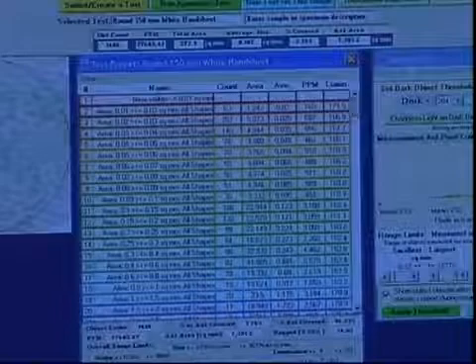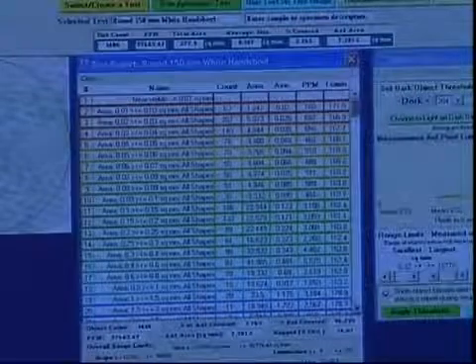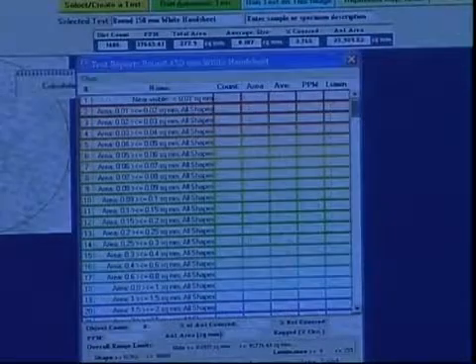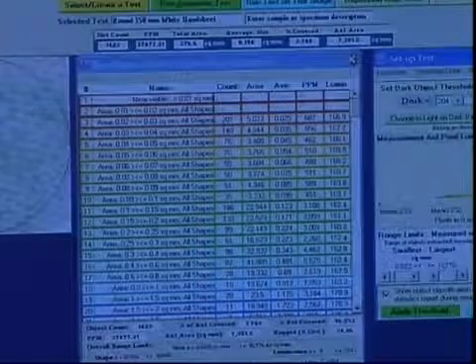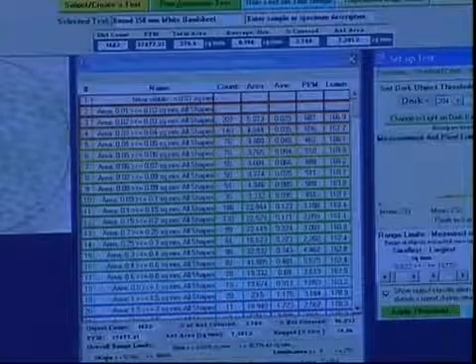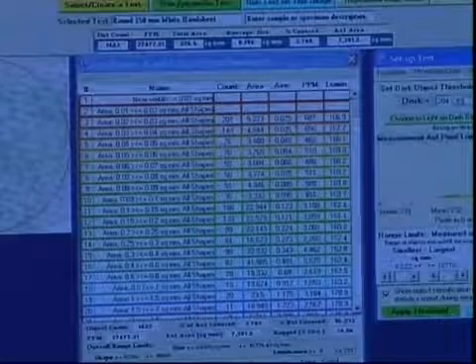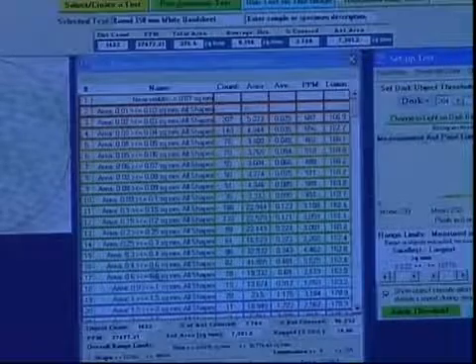We have 207 at 0.02 and above, even though we filtered out because we got rounding errors in there. Let me set that at 0.02 and we'll do it again. Yeah, now we don't have the rounding errors. You can see this is 0.01, 0.02 to 0.03, and so on down the line. All of these specs in the image are color-coded according to the classification.